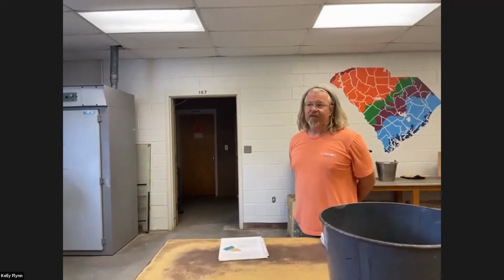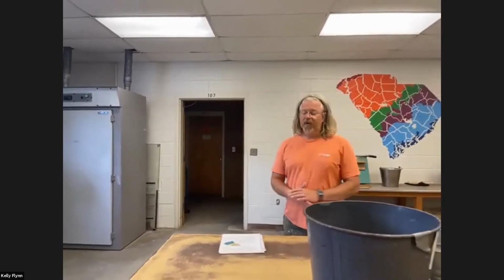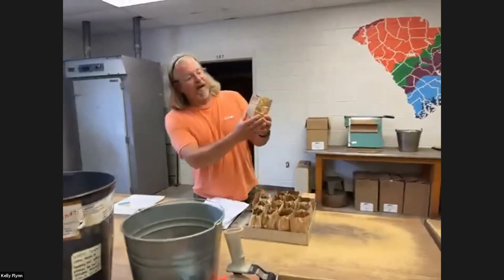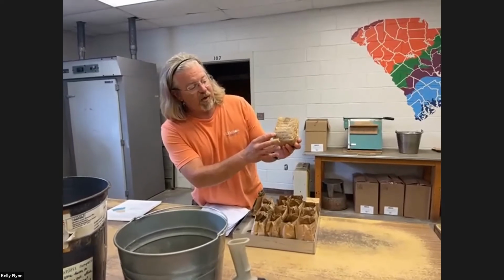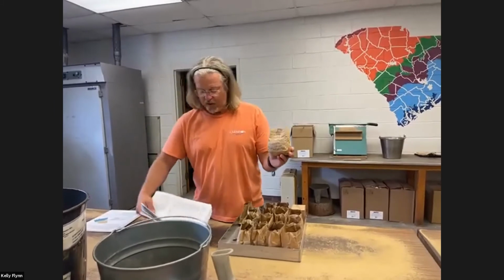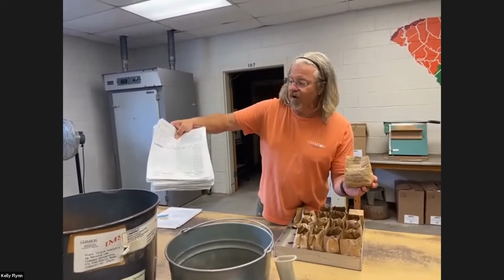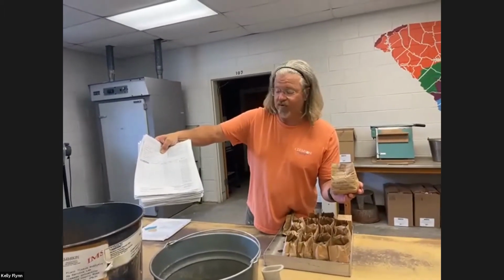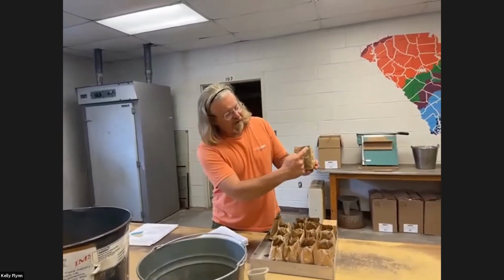UPS and mail drops once a day. We'll have a cart with big boxes full of soil, and inside those boxes are bags of soil. You can see there's an address, your county, and what you're growing, but there's also other information. That information is recorded here on our sheets. There's also an information sheet that will allow you to put in crop codes, soil types, all kinds of information about how we can contact you, because we email our results. So that's very important.